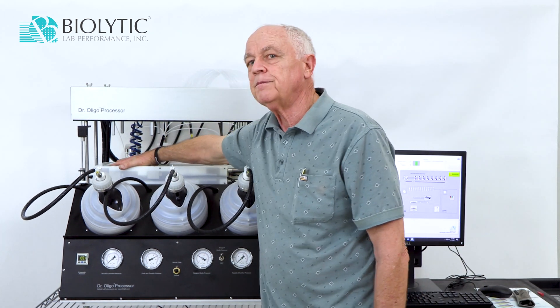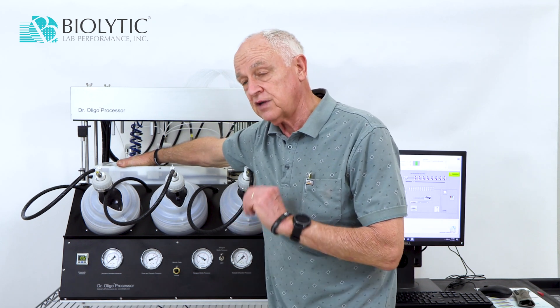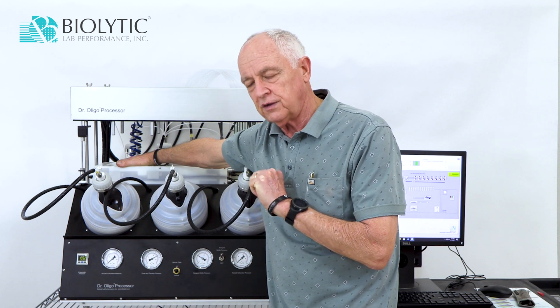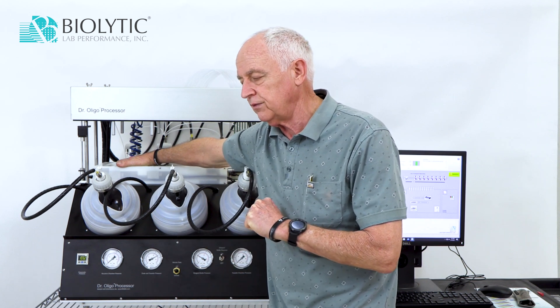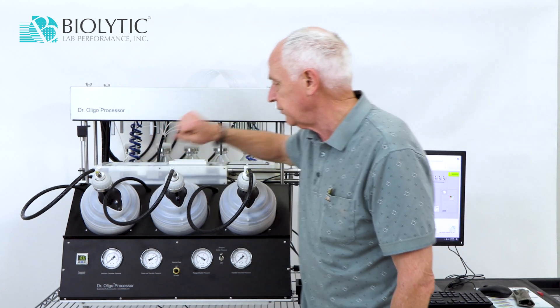Also, when this plate is over here, that's the station where we can pressurize the top of the plate and move reagents slowly through the columns, or move it out — empty the columns when we're finished — by moving it slowly through the columns. So that moves over there.